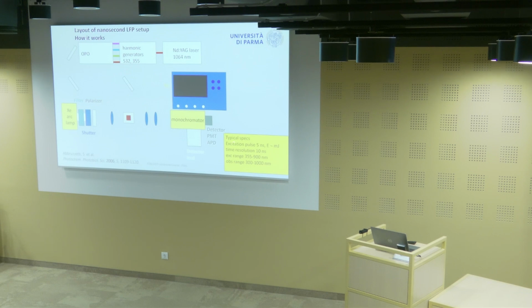Typical specs are that excitation pulses are in the 5 nanosecond range with millijoule energies. So it's tough, it's megawatts. We are not talking about low power.